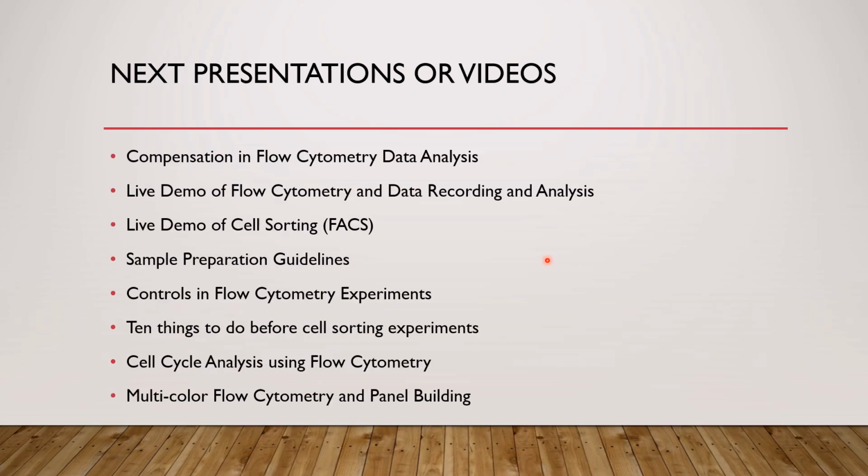So in the next presentation I will give the live demo of data analysis, and after that presentation I will give the live demo of cell sorting. In cell sorting I will completely cover how it works, sample preparation guidelines, what controls are used in flow cytometry, what you should do before you plan your cell sorting experiments, and how you can analyze cell cycle and multicolor flow cytometry.